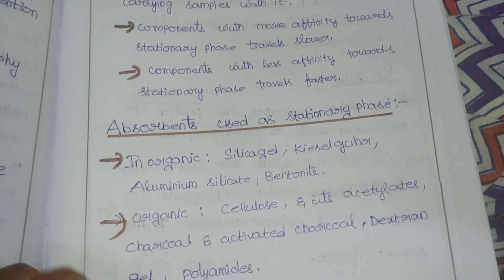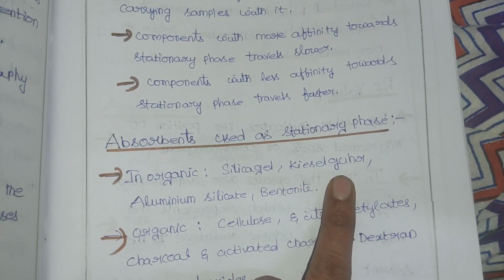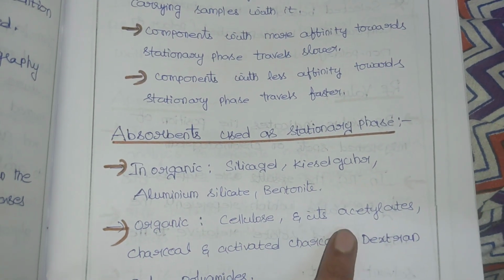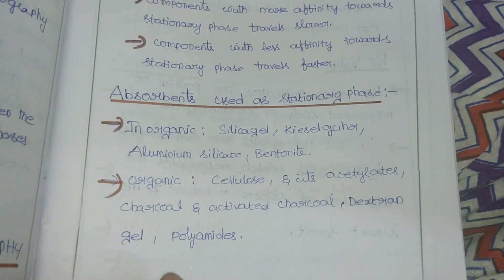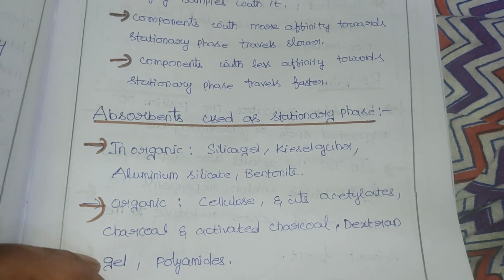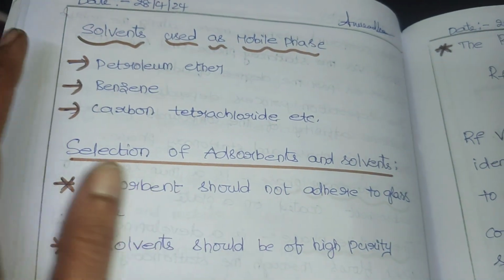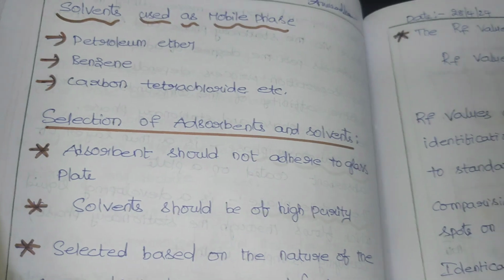What are the adsorbents we use here? Inorganic ones like silica gel, kieselguhr, aluminum silicate, bentonite, etc., and organic ones like cellulose and its acetylated derivatives, charcoal, activated charcoal, dextran gel, and polyamides. These can all be used as adsorbents in the stationary phase. What solvents do we use in the mobile phase? We can use petroleum ether, benzene, or carbon tetrachloride.